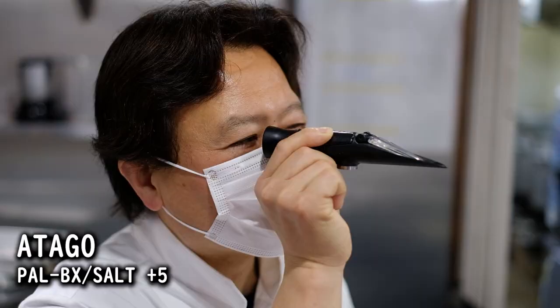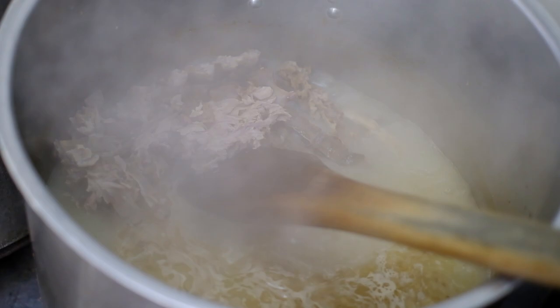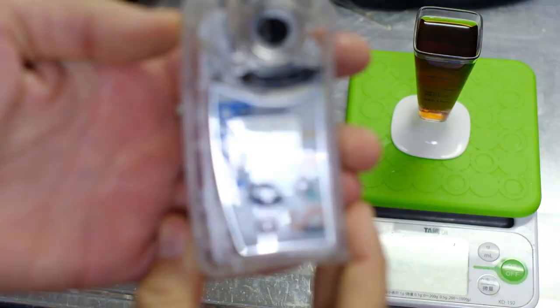This is an Atago Pocket Bricks Salt Meter. Atago is a Japanese company making scientifically accurate devices for measuring various aspects of liquids.